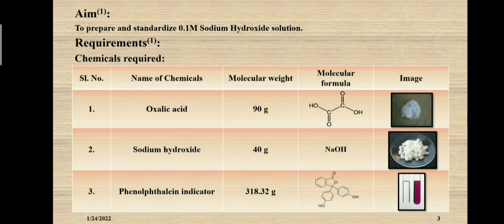Next, our main aim. What is the main aim? Our main aim is to prepare and standardize the 0.1 molar sodium hydroxide solution. Now, you have to know about the standardization procedure. The process of determining the precise concentration, the molarity, of a solution is known as standardization.